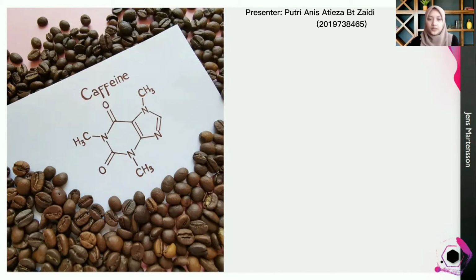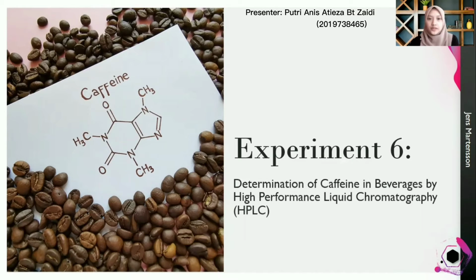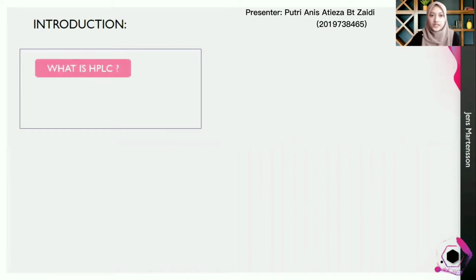Next, we will proceed with the next experiment. Determination of caffeine in beverage by HPLC, high performance liquid chromatography. First, introduction. What is HPLC?